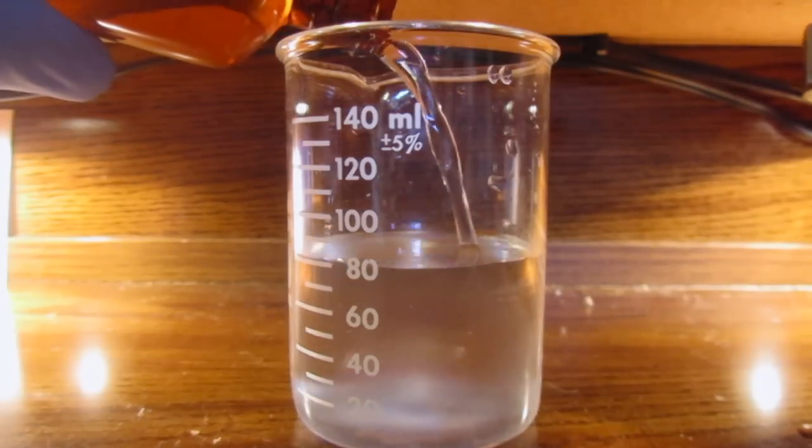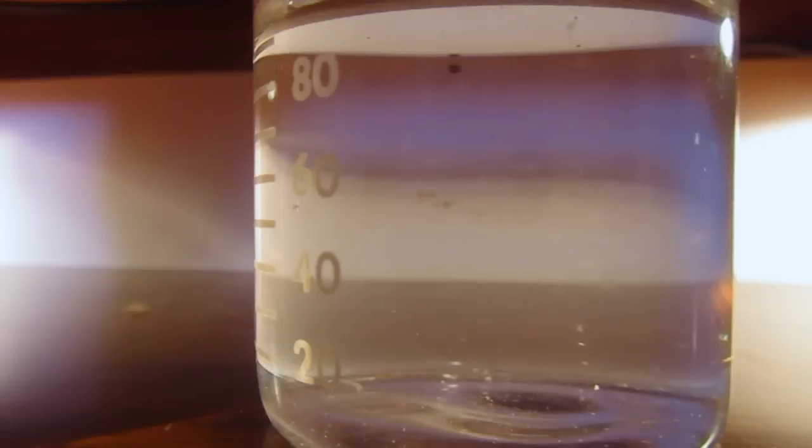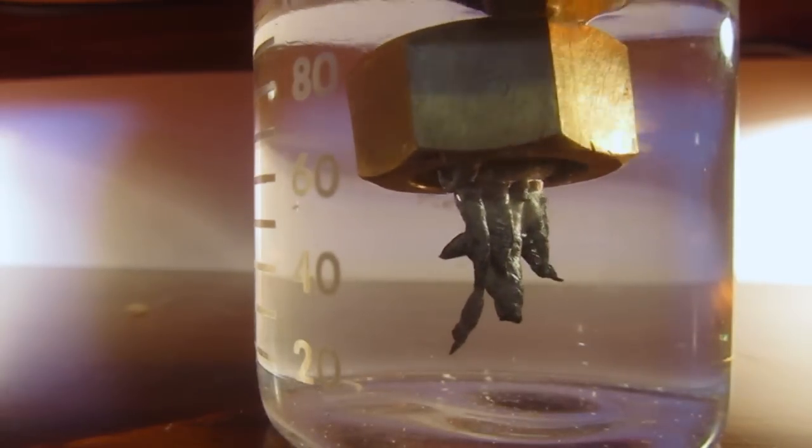To make this solution, I dissolved 10 grams of lead acetate in 100 milliliters of water. To this I added a small amount of zinc that I melted along with a brass nut, because brass contains some zinc.